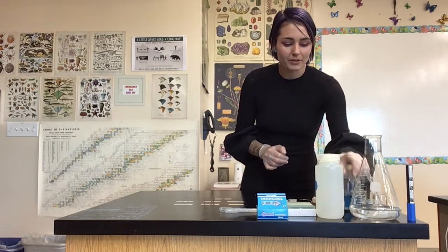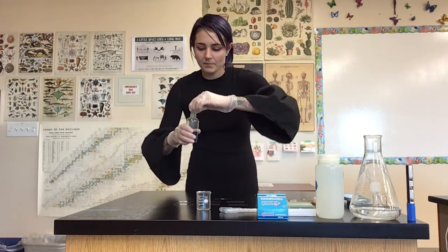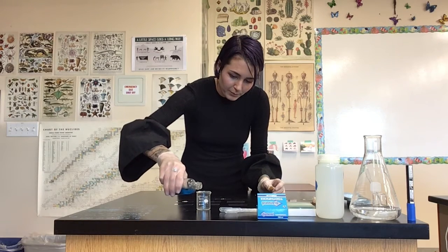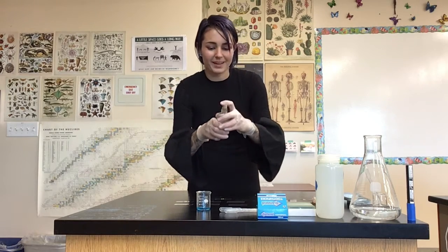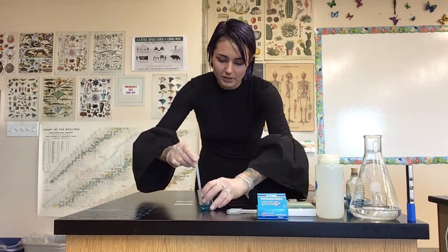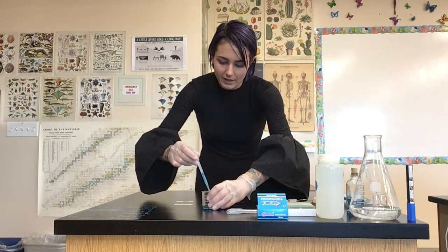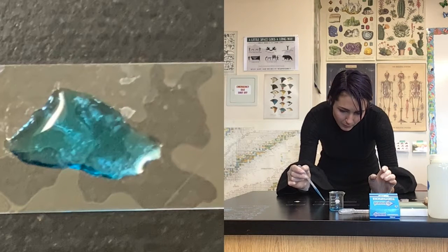So what I'm going to do is pour a little bit of methylene blue out here. Another reason I'm wearing gloves is because methylene blue does stain quite a bit, so I want to make sure I'm not getting it all over my hands. Okay, so I have just a little bit here because we don't need that much. What I'm going to do is just put a few drops over the slide with what I hope are some cheek cells.